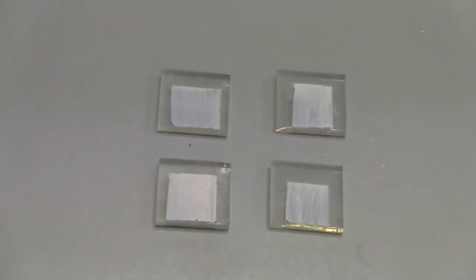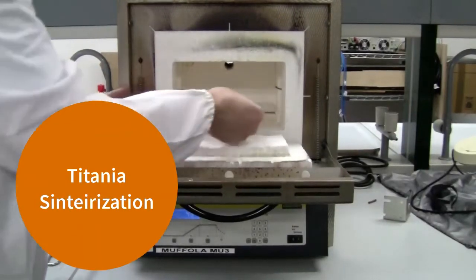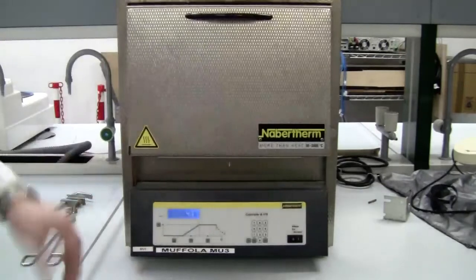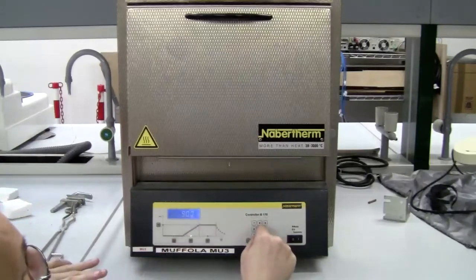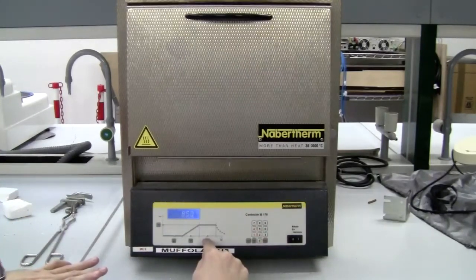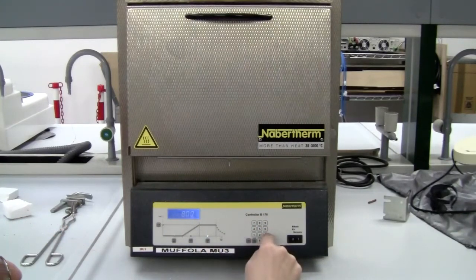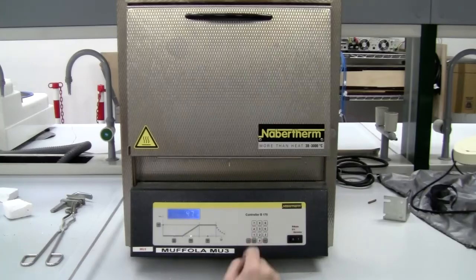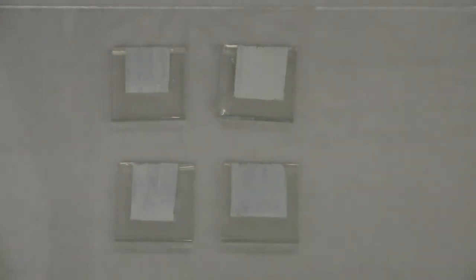Here are our slides just before sinterization at high temperature. The sinterization of titania onto the glasses is obtained by using a high temperature furnace, which will be brought to 450 degrees in a time of 50 minutes, and this temperature will be maintained for half an hour. After that, the system will be switched off and will continue to go to room temperature very slowly. The day after, we can recover the glasses, and these are the final glasses with the sinterized titania.